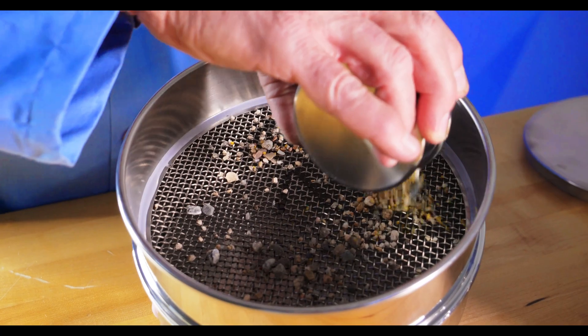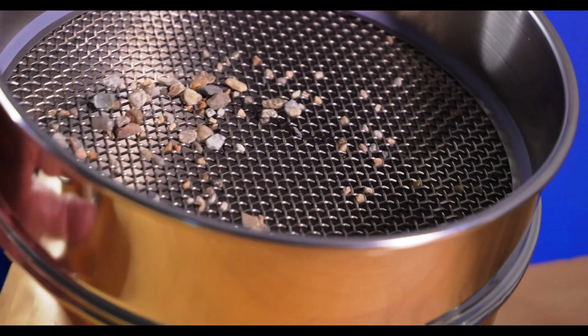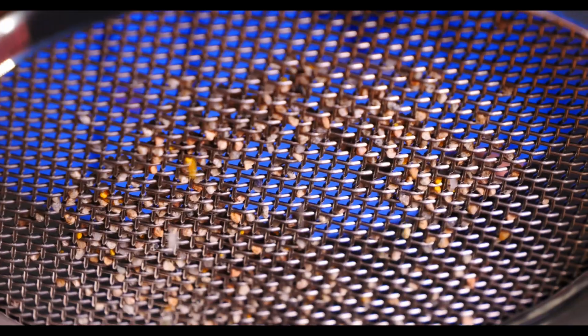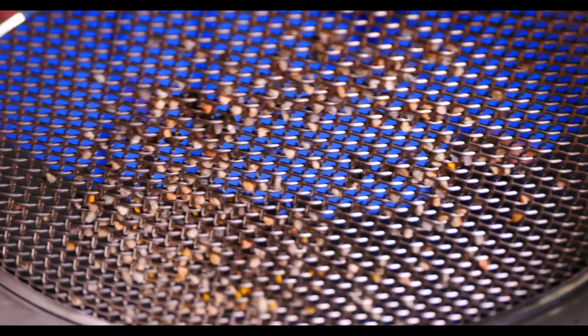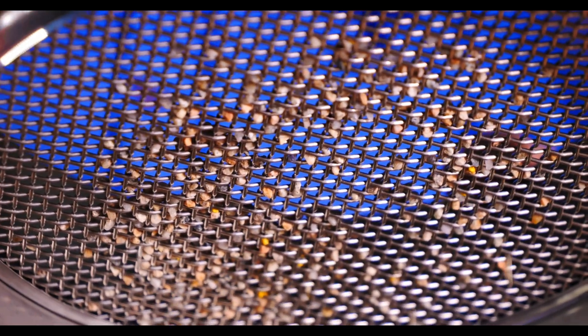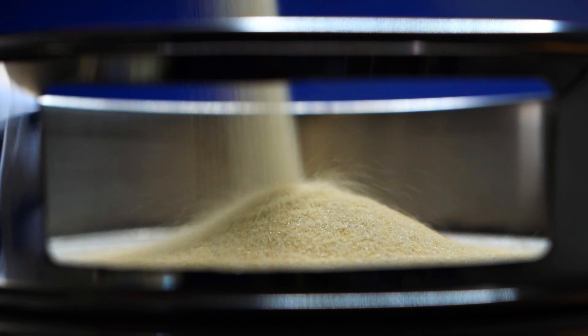One of the best ways to keep your sieves in top condition is to be sure that you're using them correctly. If you're hand sieving your material, adding pressure to the sieve to push particles through the openings could clog or even damage the mesh. Particles that are slightly too big could become lodged in the openings, or even permanently stretch the mesh. Another common mistake is putting too much material in the sieve at once. Doing this could cause blinding, which occurs when the holes in the sieve get clogged up, stopping particles from free-flowing through the mesh and skewing results.